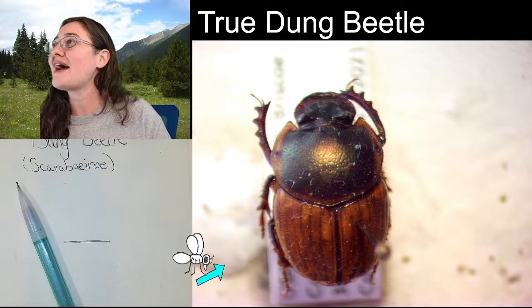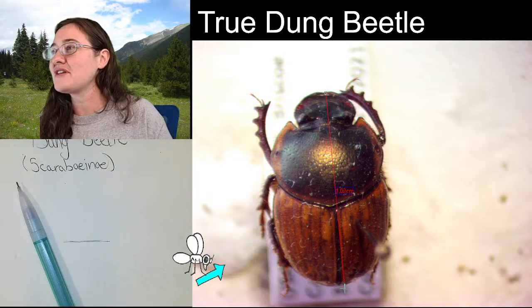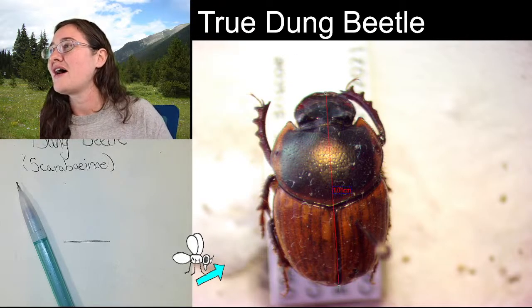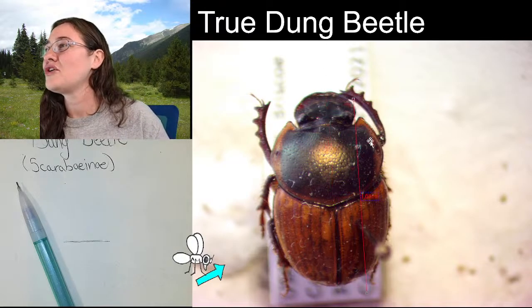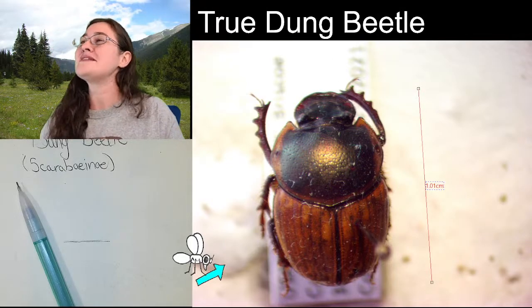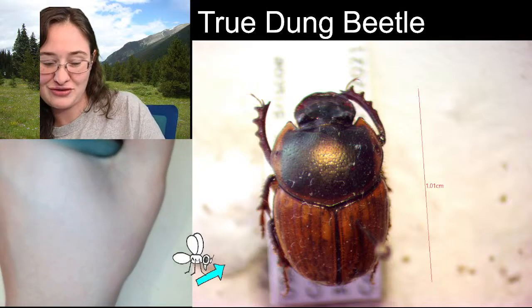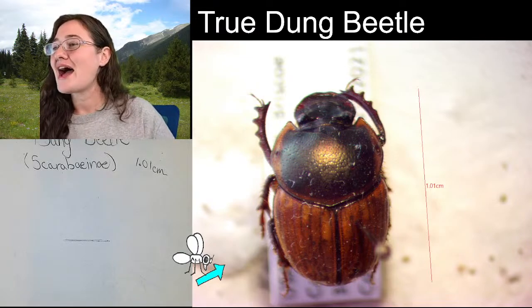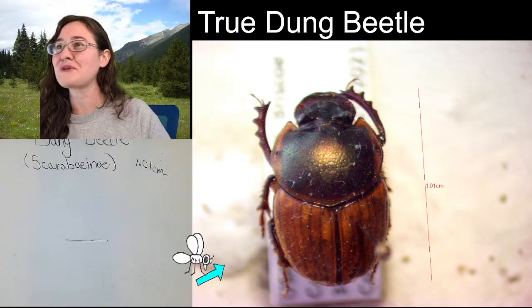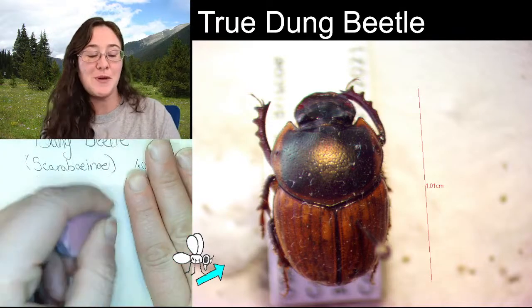So I'm going to go ahead and measure our specimen here from the front of the head to the end of the elytra. Oh, look at that. Aww. He is 1.01 centimeters. He's so cute. There's definitely another dung beetle I'm excited to share with you, but it's not pinned yet. So once it's pinned, you'll be able to see it.